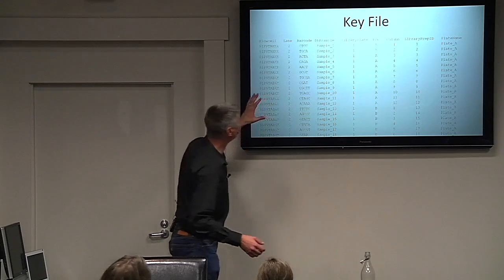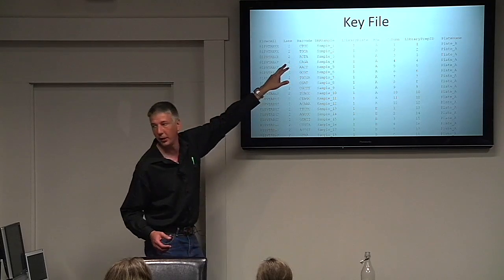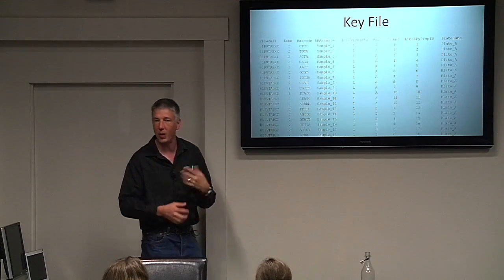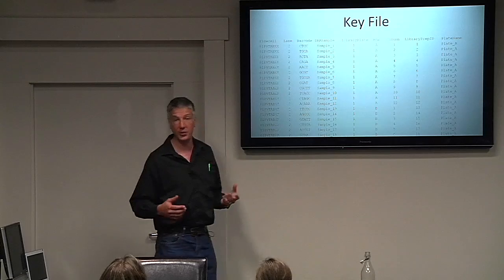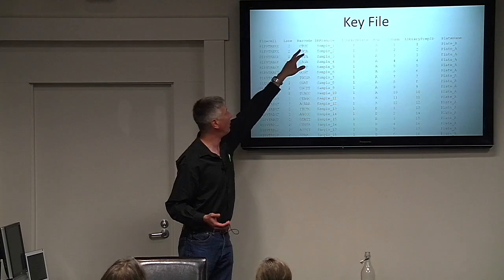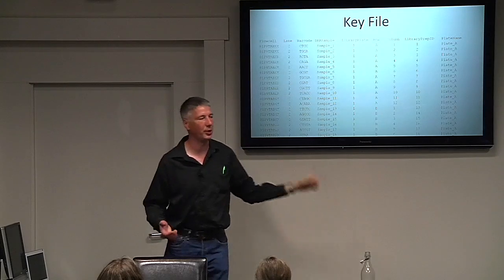Okay, so what makes a unique sample? What in here helps you identify the sequence and put it back? Well, there's the barcode, that's one thing, right? But also this flow cell. This comes from Illumina. They have a stamp on there that says this is the flow cell name. It's read by the machine and is incorporated into the file. So you've got a flow cell, and we know that there are 8 lanes on a flow cell. So within a lane, this is the lane. So this gives you a barcode within a lane within a flow cell, and that will give you the sample. Does that make sense? That's how we can actually reuse barcodes.